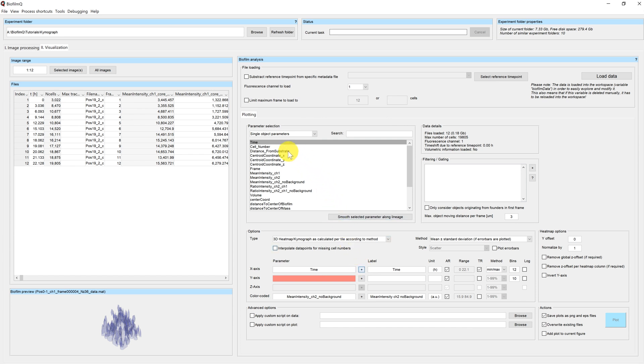As a spatial parameter we will choose distance from substrate. So we will see how the fluorescence changes depending on the biofilm height.